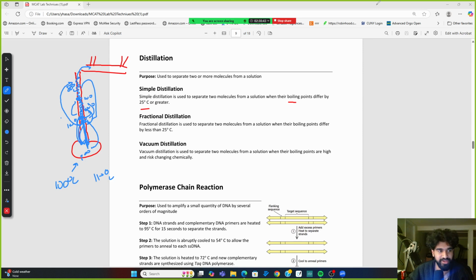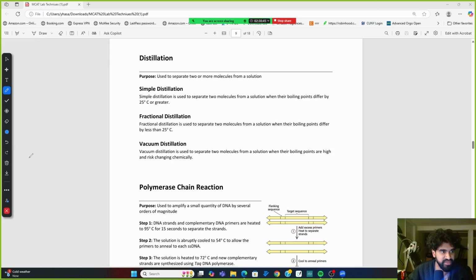I explained that so well, thank you. My teacher explained it well to me. So imagine every part of the fractionating column, like this with all the aluminum foil, section A, section B, section C, and section D. Each and every single one of them needs to be warmed up to the specific boiling point of your temperature before it has to come out. Does that make sense?